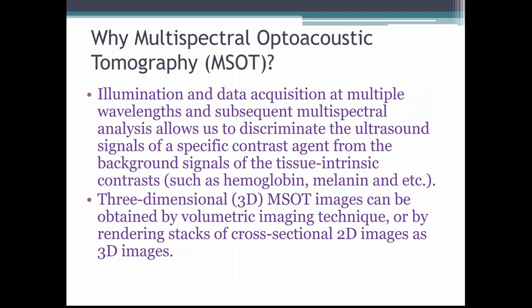And we are particularly interested in adopting MSOT imaging because this method has many beneficial features. For example, illumination and data acquisition at multiple wavelengths and subsequent multispectral analysis can allow us to discriminate the ultrasound signals of a specific contrast agent from the background signals of the tissue intrinsic contrasts, such as hemoglobin, melanin, and etc. In addition, three-dimensional MSOT images can be obtained by volumetric imaging technique or by rendering stacks of cross-sectional 2D images as 3D images.